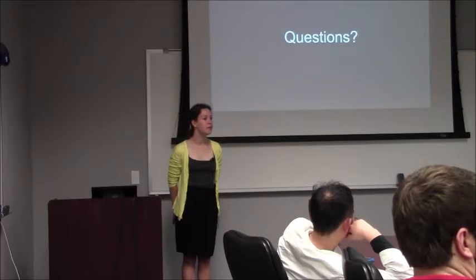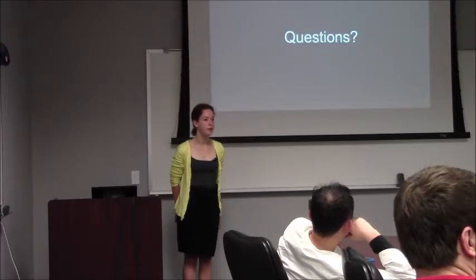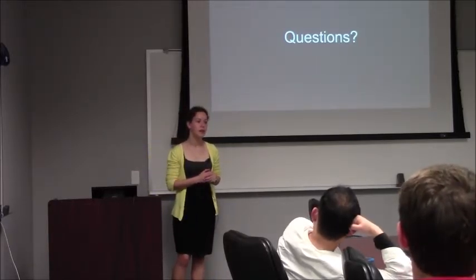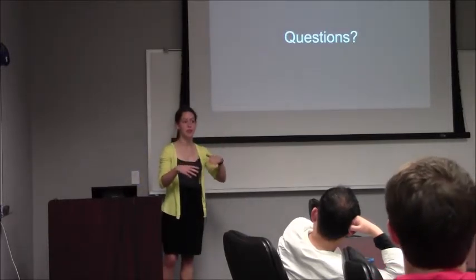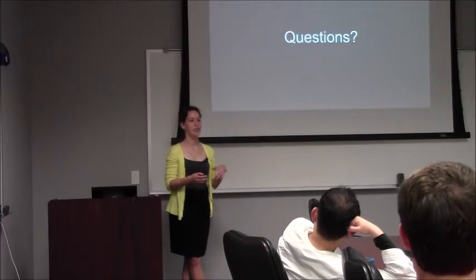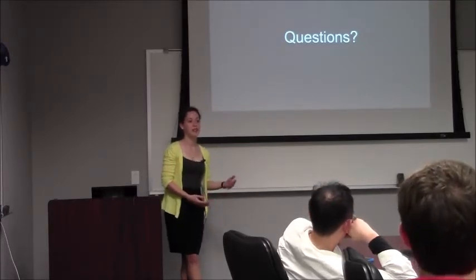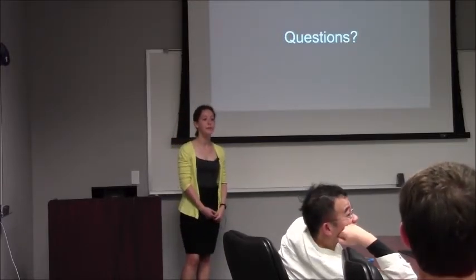And one other question: I think somewhere in the code, you did the first model matrix. I think it had no intercept. Oh, it was 0 plus group. So that's common to put in a model. For that one, I put the 0 in there because later I wanted to do a contrast with the 3. Okay. You could do it the same without it, just your contrast would be different numbers. I just thought it would be more clear because I said 3 groups and then there were 3 numbers there. But definitely you could do it without it. You just have to change what your syntax later on was.